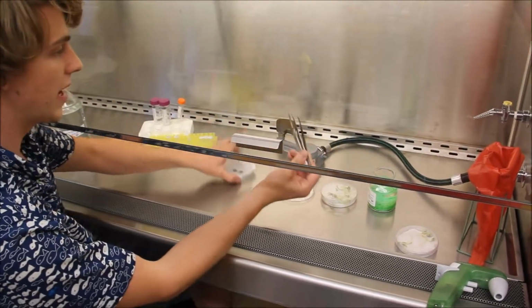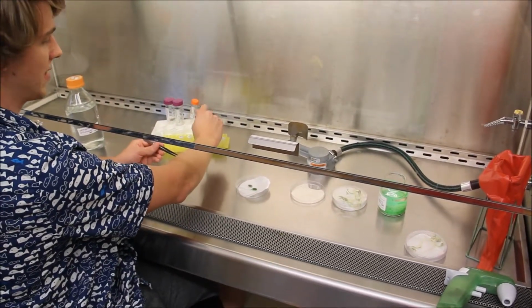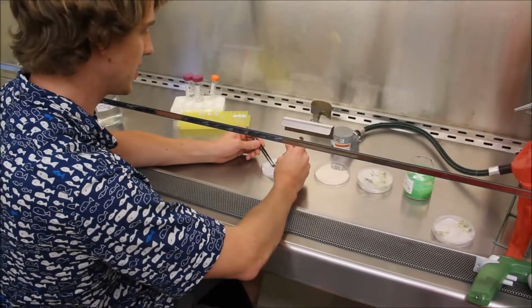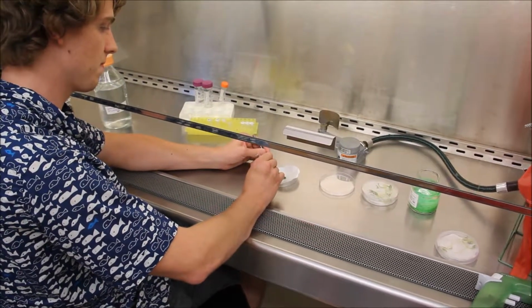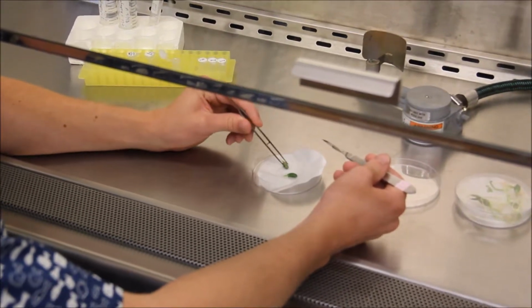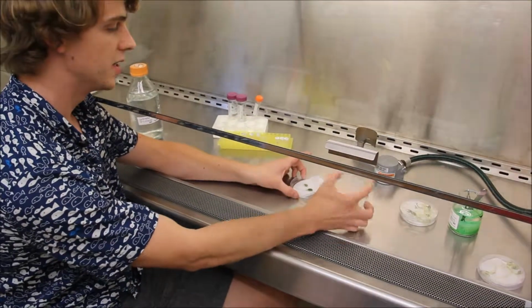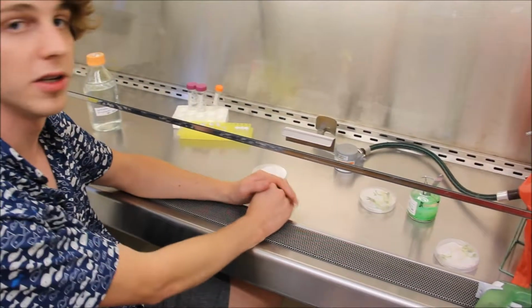And for the actual Agro transformation part of this process, you dip your scalpel into your Agro. This Agro has the GUS reporter gene and GFP. And what you do is you make, on the flat side, just some cuts. I like to do 3 cuts long ways, 3 cuts the other way, and you just flip it upside down. Once it's on the flat surface like this, you're ready, and that cotyledon should form hairy roots after about a week or so. And depending on the length of the roots you want for your assay, you can use it whenever you feel it is able to be used.